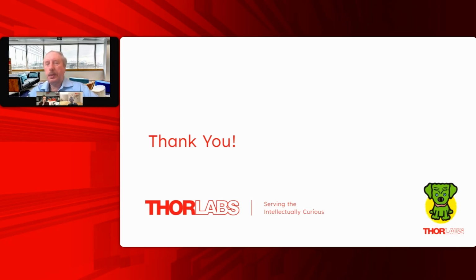Typically we use 15x or 36x objectives. With 15x, you have about 1 inch working distance, so you can put additional samples or a cryostat and so on. But that's our standard.